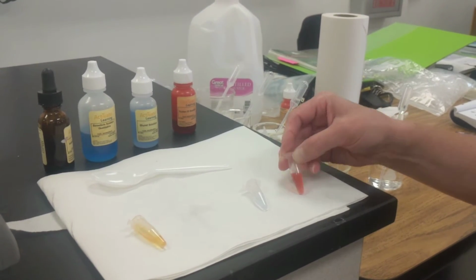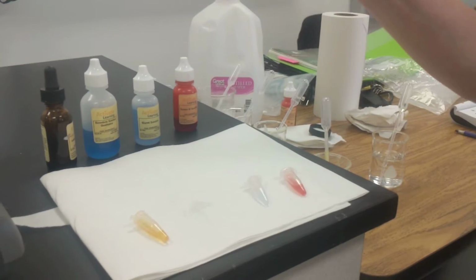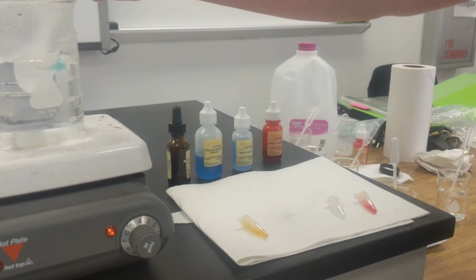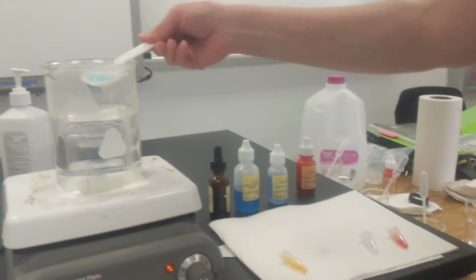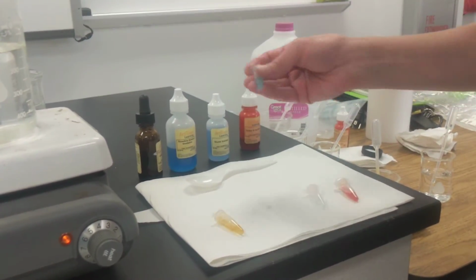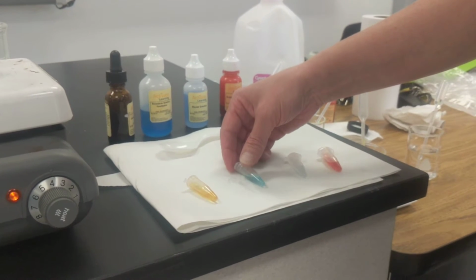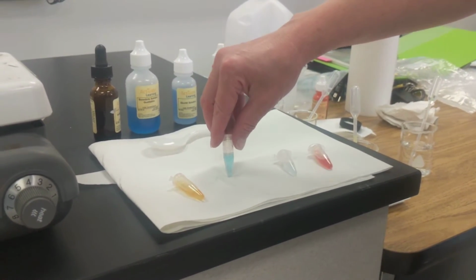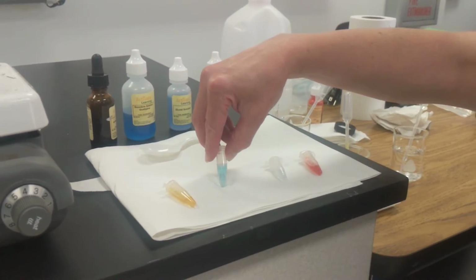Okay. All right, so let's see how our hot water bath is going with this. If I can get it out with my very technical spoon here. All right, and that is staying blue. So no sugar in the water either.